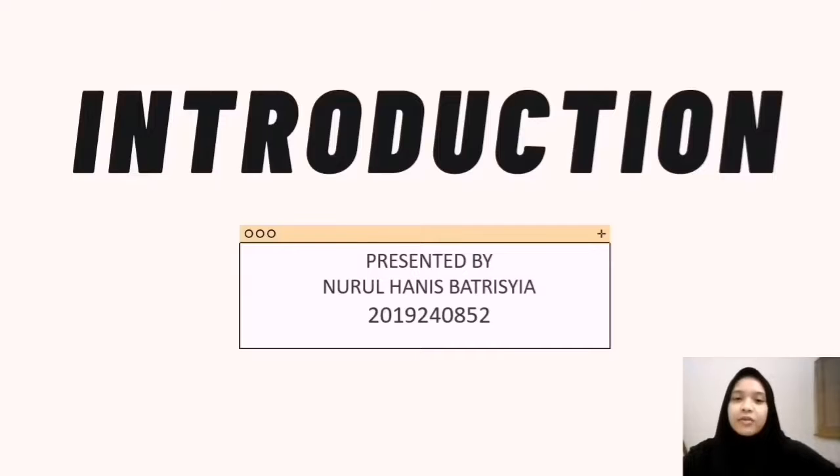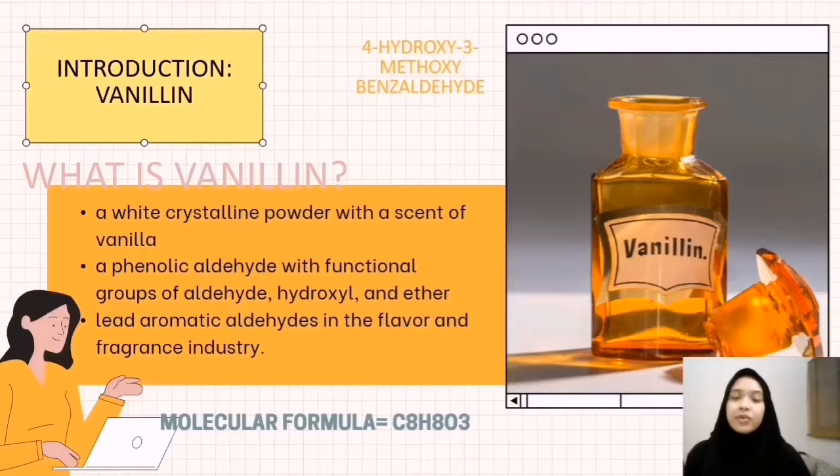So I'm going to start off our group presentation by presenting the introductions of vanillin, gas chromatography, and also high performance liquid chromatography. Vanillin, also known as 4-hydroxy-3-methoxybenzaldehyde, exists in a form of white crystalline powder with a scent and taste of vanilla. This is actually a phenolic aldehyde that contains a functional group of aldehyde, hydroxyl, and also ether. Vanillin is the most common aromatic aldehyde that is widely used in the flavor and fragrance industry.